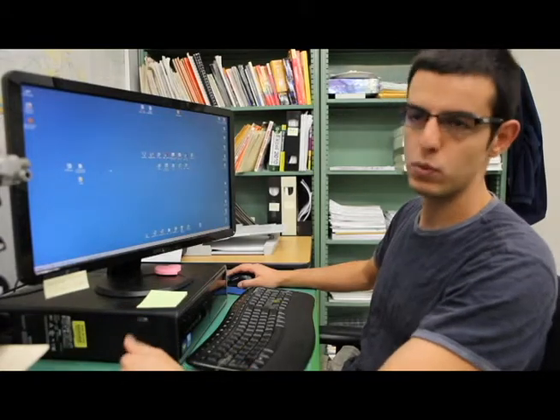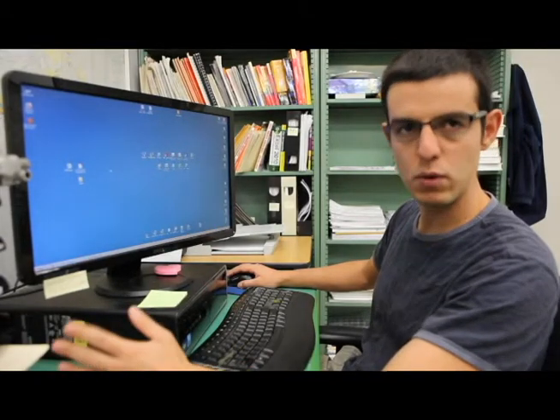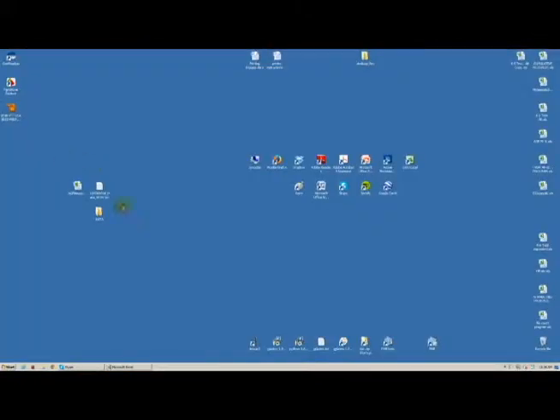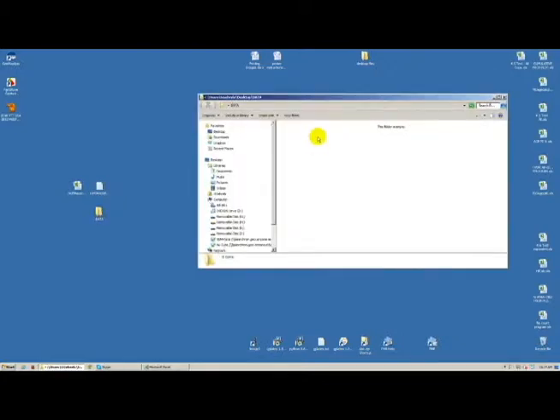So in this video, we're going to learn how to reduce the data that we've acquired on the new ICP-MS. For doing that, here on the screen, I have three files that we're going to use. We have the new PM HCalc macro, that is the reduction program. We have one of these data files that is being produced as we analyze the sample. And we have a folder that right now is empty.